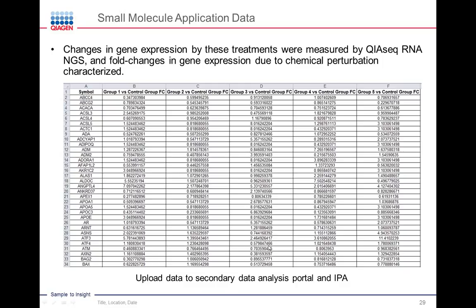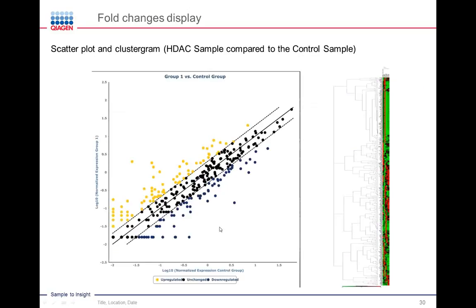Or you can take the same information and upload it to the Ingenuity pathway analysis pipeline. If you're interested in knowing more about data analysis, and I highly recommend this, please attend next week's webinar, where Melanie and John Noel will go through an extensive presentation on how the data analysis portals work.